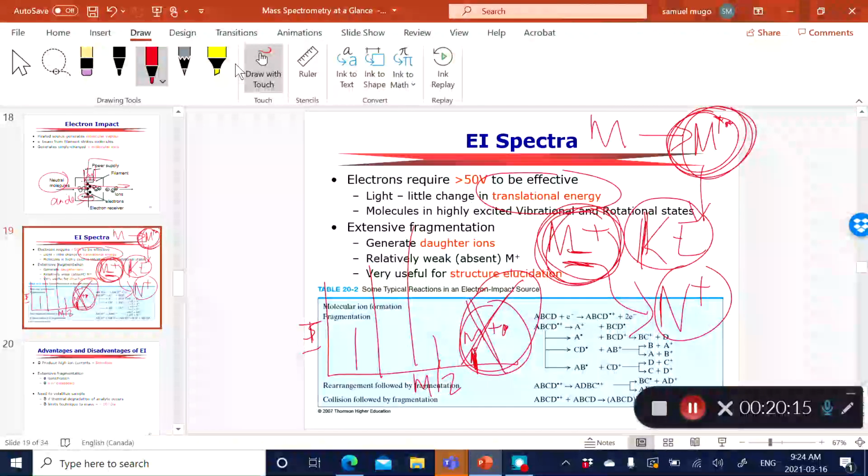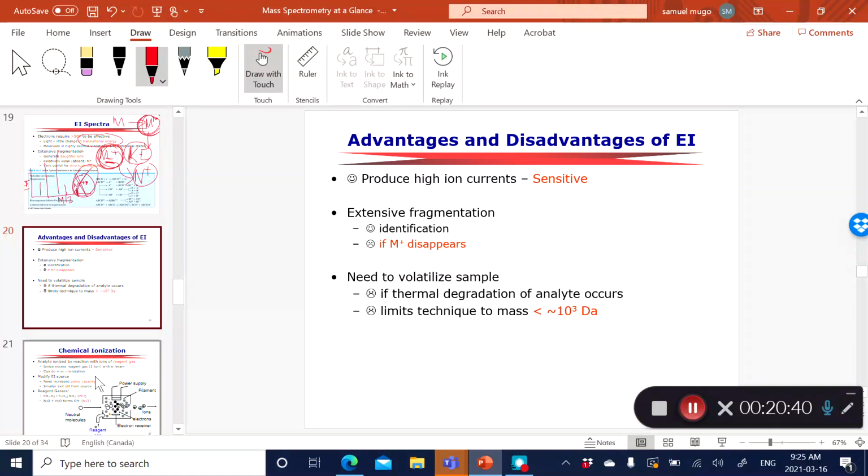Again, there's a lot of chemistry involved in this, which I won't get into. The gas phase chemistry can be fairly complicated, and of course, we don't have a lot of time for that. But the emphasis is that EI is a harsh method of ionization that causes a lot of fragmentation, for small molecules, often volatile, which is the most common application of EI, because it's the ionization method used with the GC, and GC typically is used to analyze volatile or semi-volatile organic compounds.